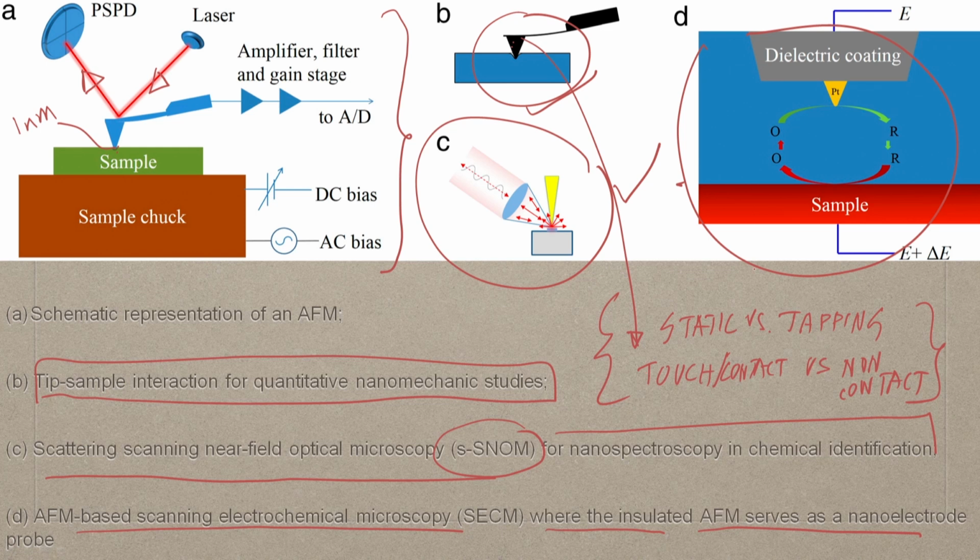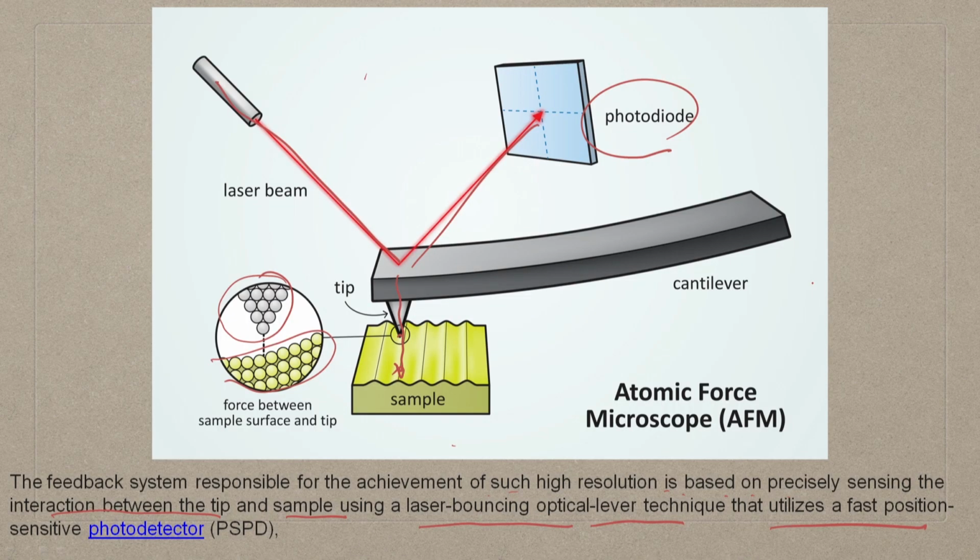Third, you create disturbances, a known amount of disturbances, and see the change. Does it resonate, and at what frequency? We'll come to that, where we will talk about the resonance frequencies of these different kinds of probes which are being used. So in the next class we'll talk about the different kinds of modifications which have been done with AFM and how this is completely revolutionizing our understanding of molecular detection and structure as a whole. Thank you.